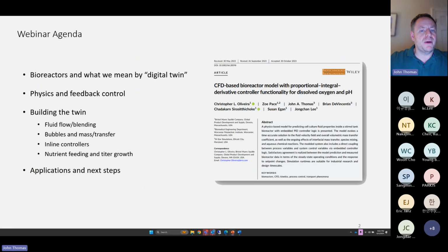Okay. Webinar agenda today, we're talking about bioreactors and digital twins thereof. And I'm particularly speaking to a paper I published last year with Bristol Myers Squibb on bioreactor scale-up, bioreactor optimization, and bioreactor design. And so everything I'm speaking of today was addressed in this paper, as well as a more recent paper with Pfizer that I can send on a case-by-case basis. But I'll be talking about what goes into a bioreactor and how we attempt to model it. And also I'll be talking about the idea of a digital twin. I'll be talking about the physics and feedback control. By that I mean the PID control systems that govern bioreactor performance.